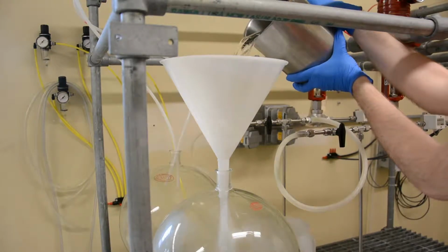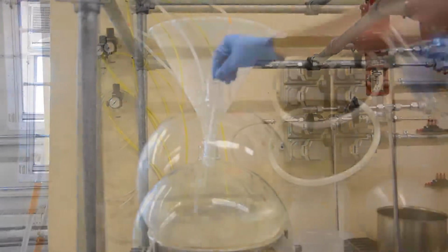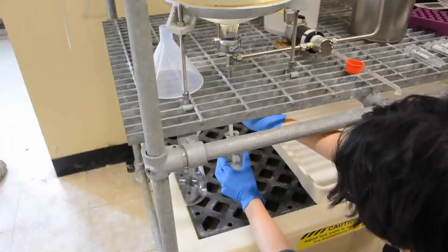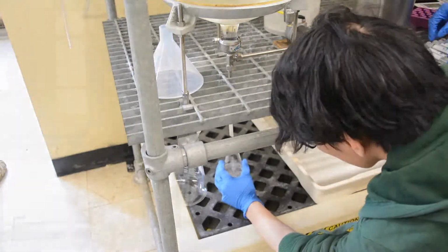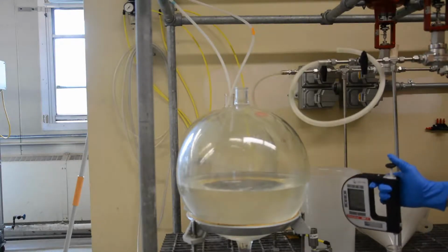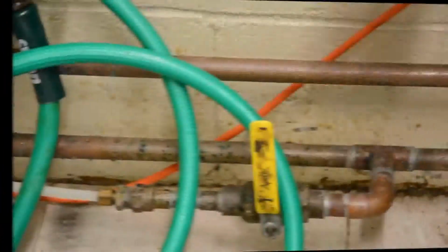The first step is to add appropriate amounts of kerosene, then acetic acid to the organic front tank and stir the mixture for a few seconds. Second, once the mixture settles, take a sample of this to determine the appropriate starting density and adjust if necessary. Third, add appropriate amounts of water to the aqueous back tank.